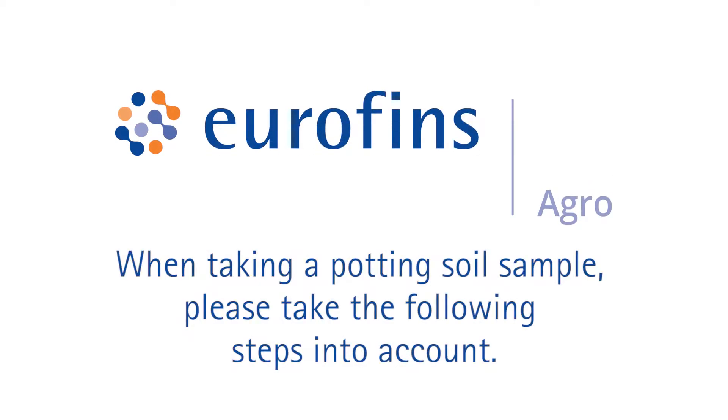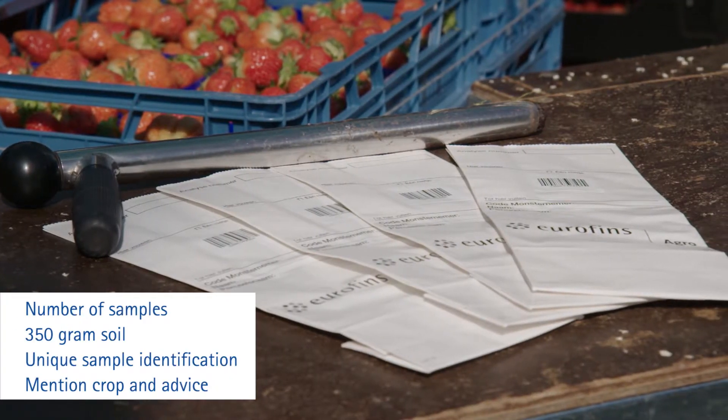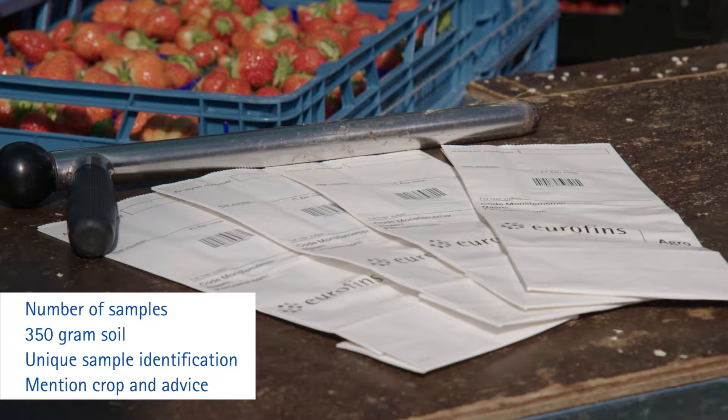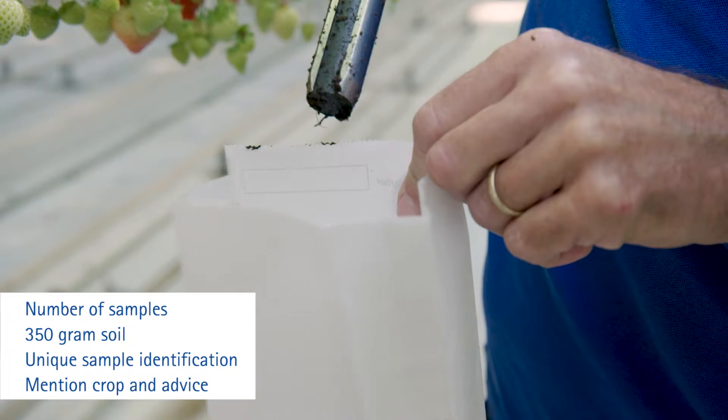When taking a potting soil sample, please take the following steps into account. Consider how many samples you need and prepare the correct number of bags. We need 350 grams of soil per sample.